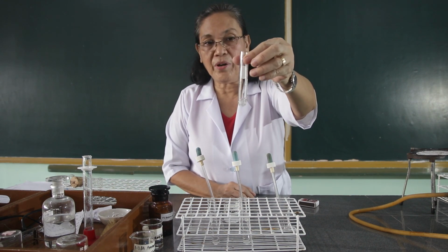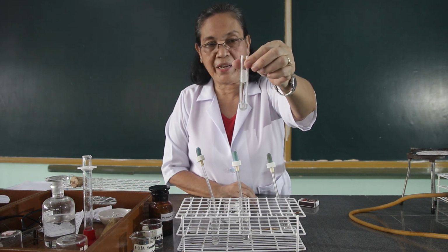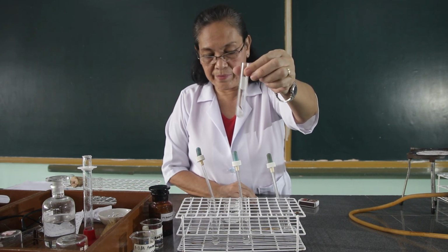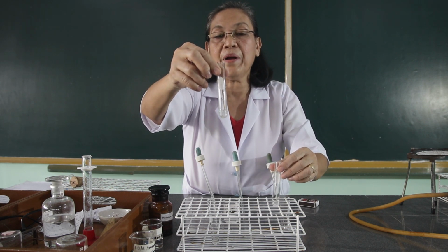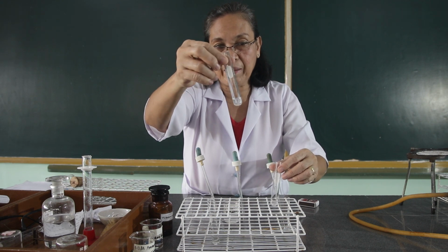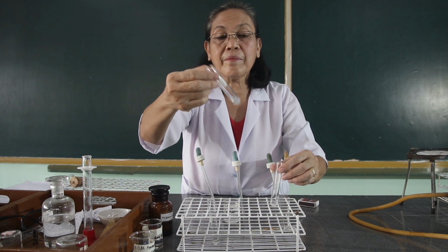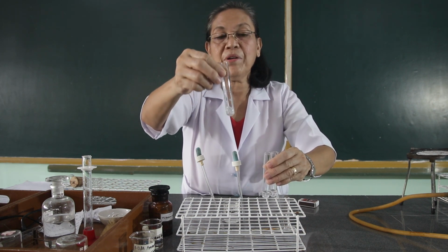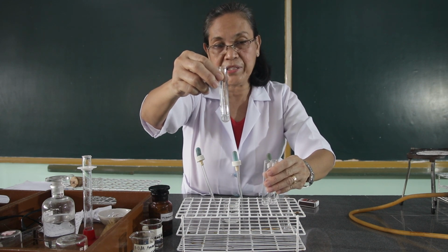This is the sodium chloride added with the potassium pyroantimonate. This is the potassium chloride added with the potassium pyroantimonate. And this is the ammonium chloride added with the potassium pyroantimonate.